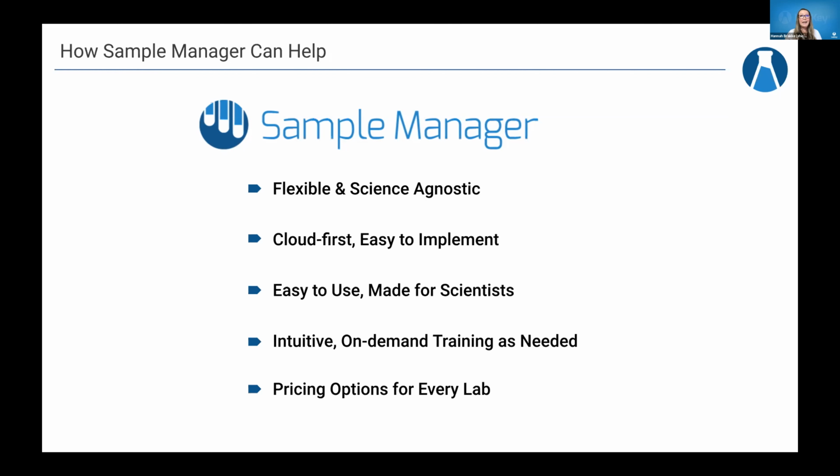And when training is going to feel like a chore, again, it's meant to be intuitive, meant to be easy to use. But when all of that fails, if you are struggling with something, we have lots of documentation. We also provide on-demand training as needed as part of the subscription. We want you to be successful. And then of course, there's not a lot you could do about cost or lack of funding, but ultimately we are trying to provide a lot of different pricing options for different labs as well.